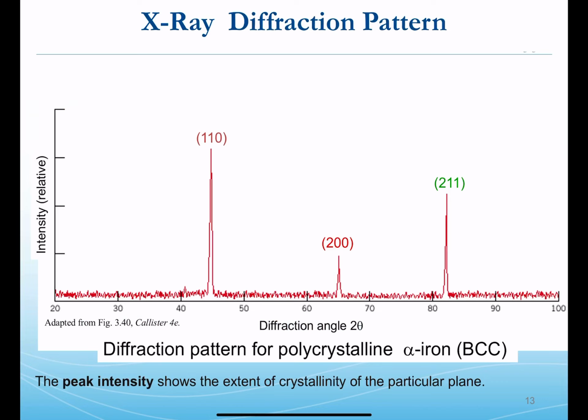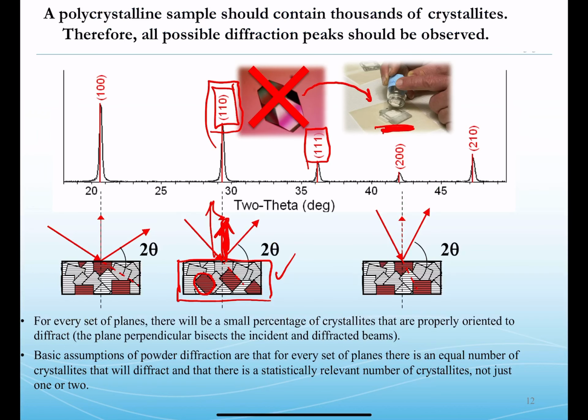We mentioned briefly that the sets of atoms is responsible for how high these peaks are. And the next piece we'll consider here is that the peak intensity is also related to how many planes we have available to help us with the diffraction. So in other words, how big are these crystals? If that red crystal there is very large, we have many sets of planes, and so the crystal size being very large helps us have enough sets of planes to build intensity at the detector. But if it's very, very small, only a few sets of planes, we don't have enough density of planes of atoms to build us intensity at the detector.